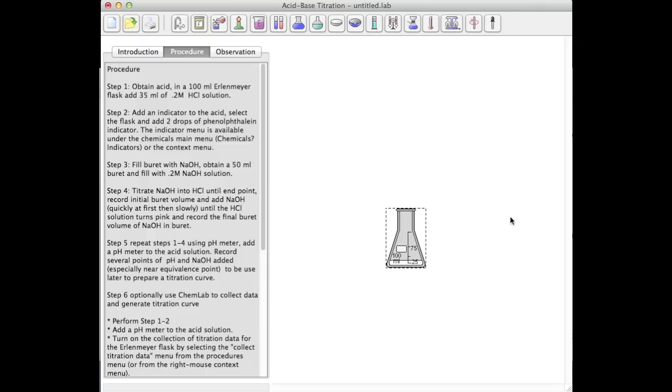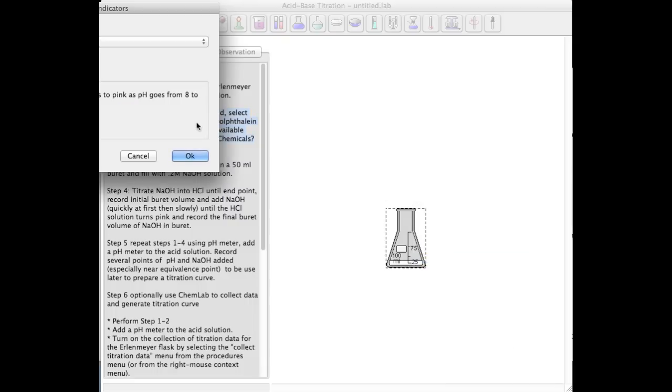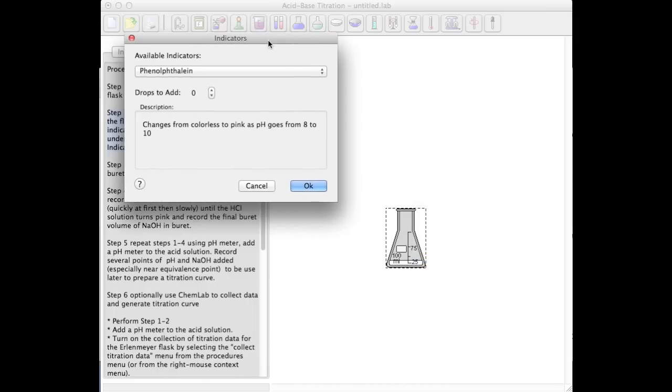Next, I'm going to add an indicator to my flask and I'm going to do so by using the right mouse button context menu. I'm going to select the indicator dialog box and add two drops of phenolphthalein.